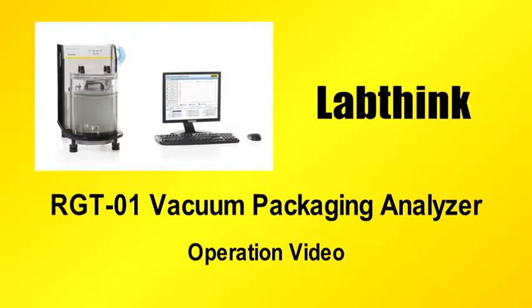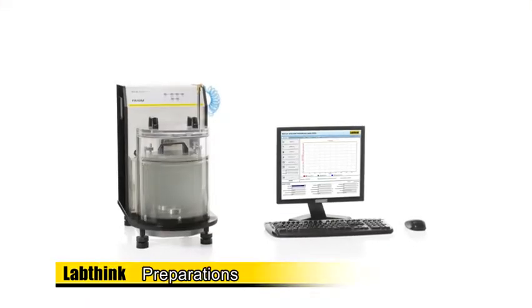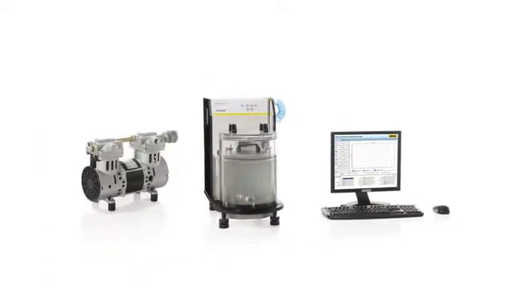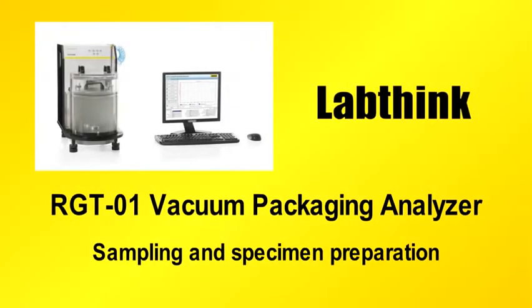RGT-01 Vacuum Packaging Analyzer Operation Video. Preparations: Mainframe, monitor, and keyboard. Vacuum pump. Specimen. Sampling and specimen preparation.